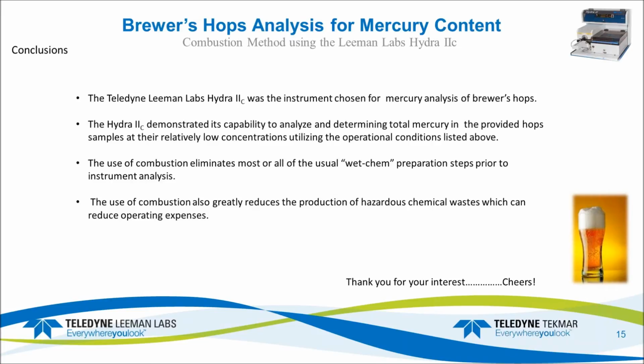We chose this one because it's so much quicker and easier to just throw the samples on and check for complete combustion. We had good ability to see the relatively low concentrations without using the preload, to save a little bit of time. If we use a combustion technique, you don't have as many steps preparation-wise, and you create a lot less acid and waste products that can cost extra money to get cleaned up or transferred out of your lab appropriately. You normally have to spend quite a bit to have those hazardous wastes taken away.